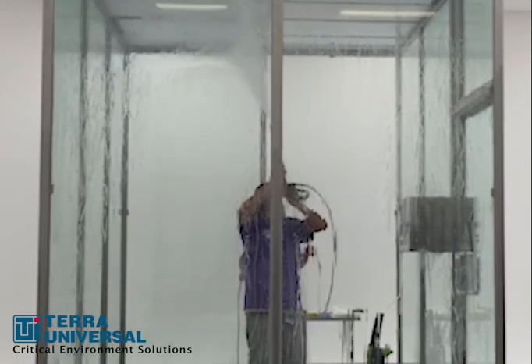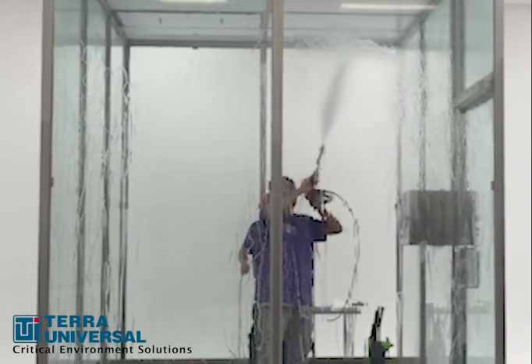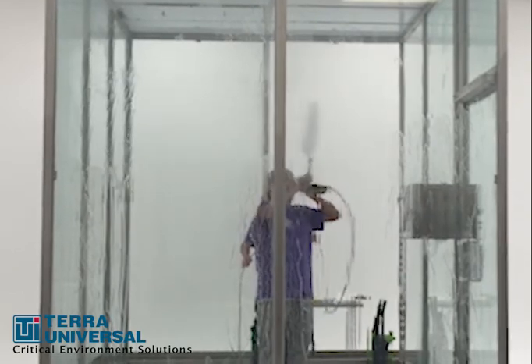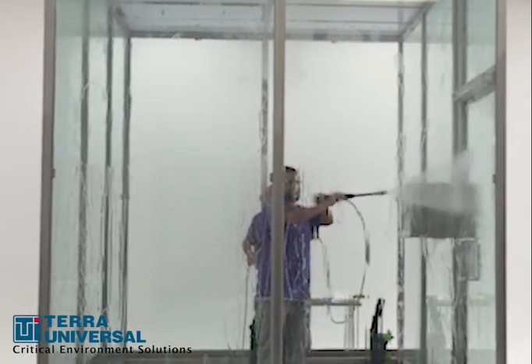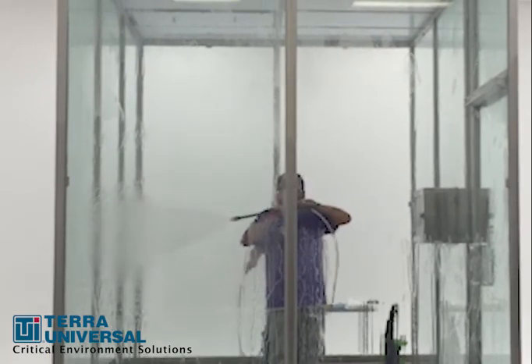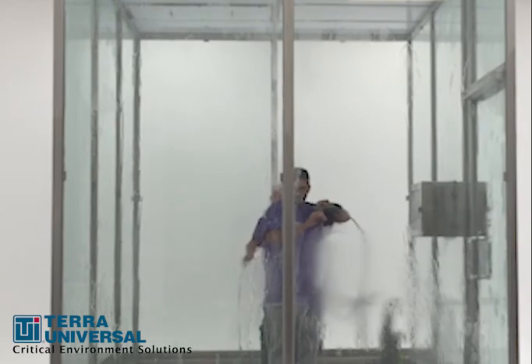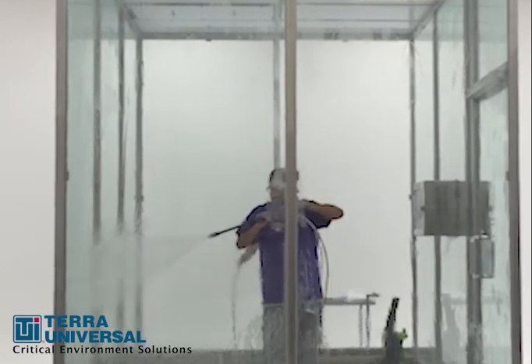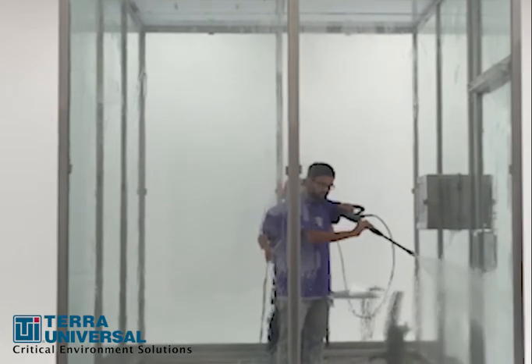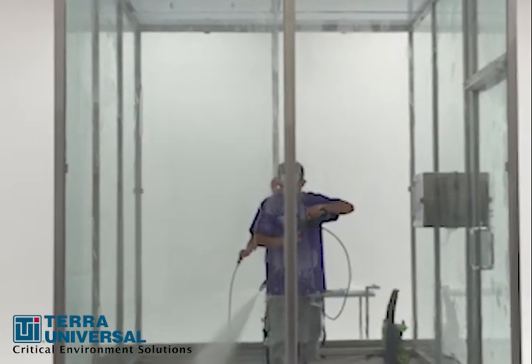Watch our demonstration in this 13 by 8 and a half foot room — the ceiling is 11 feet from the floor. The room has already had cleaning chemicals applied, so now the team is rinsing the surfaces with a powerful stream of purified water. In the presence of sterilizing chemicals, proper personal protective equipment would be required. They follow best practices by starting at the room's ceiling and working in a slow and steady pattern downward, letting gravity wash all contaminants down to the floor.